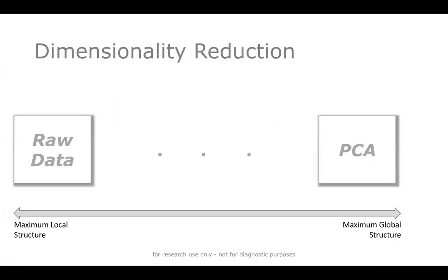Okay, so first thing I mentioned I'm going to talk about is TriMap. But before I talk about TriMap, I want to talk a little bit about data structures. I know this is something that not a lot of biologists are super familiar with, so just to give you a little kind of rosy picture of how dimensionality reduction can work.